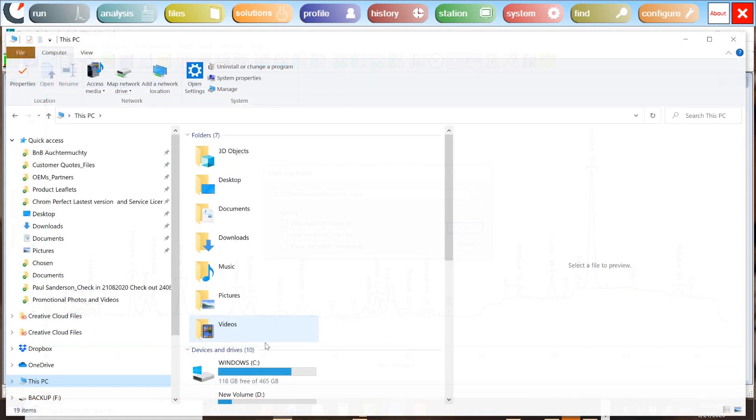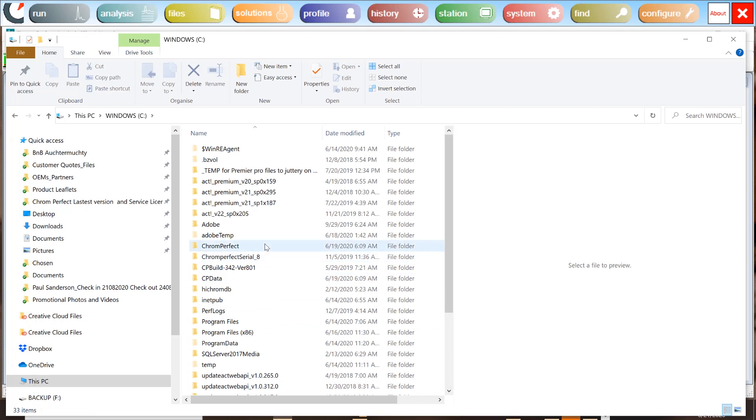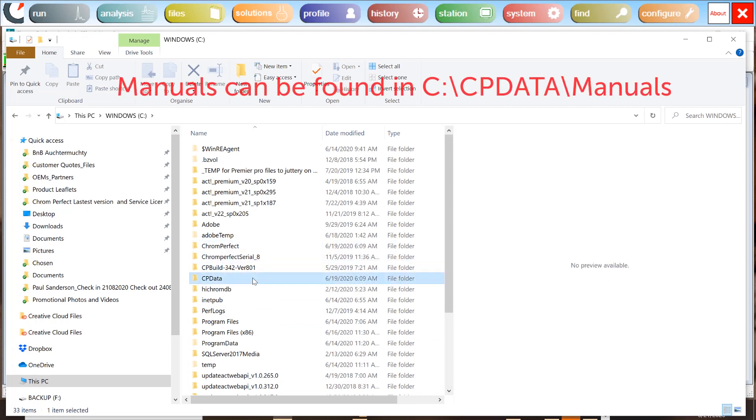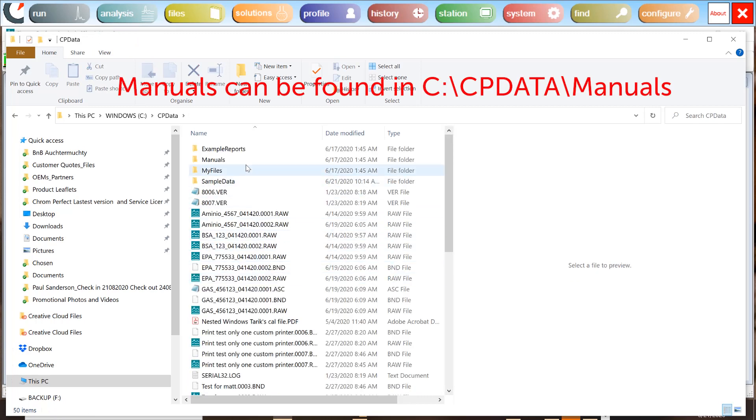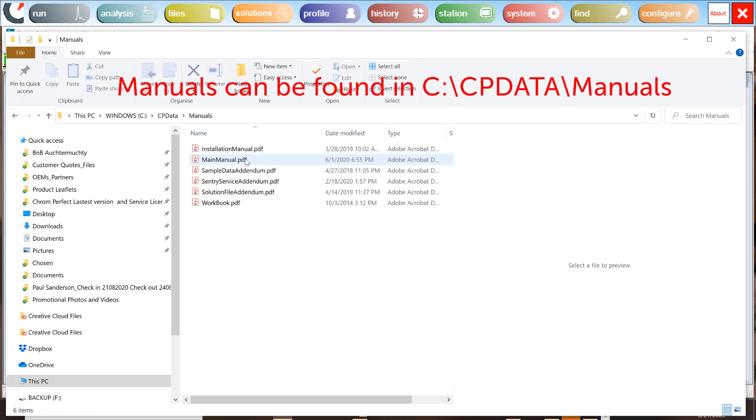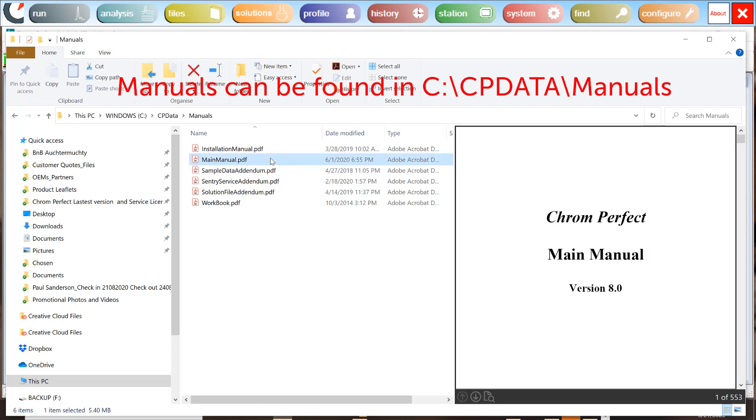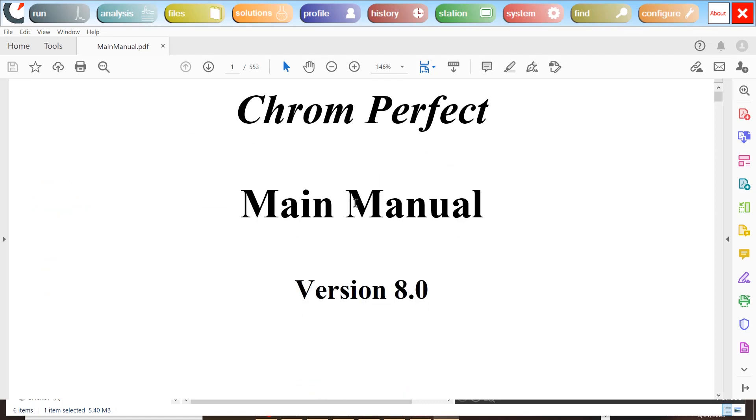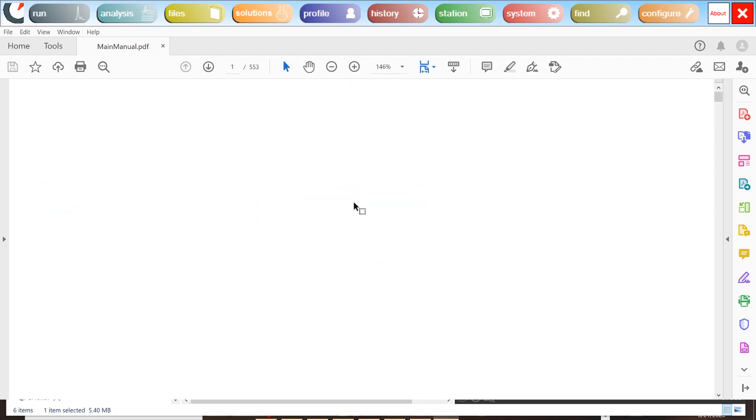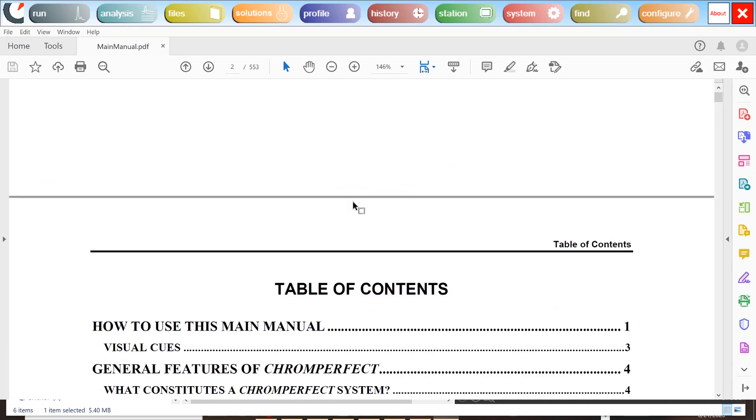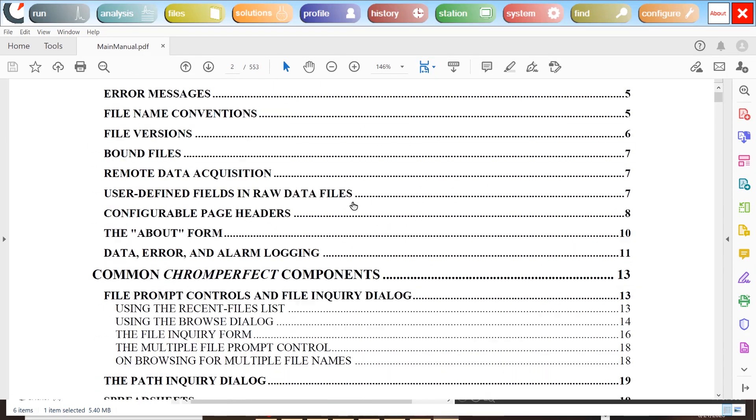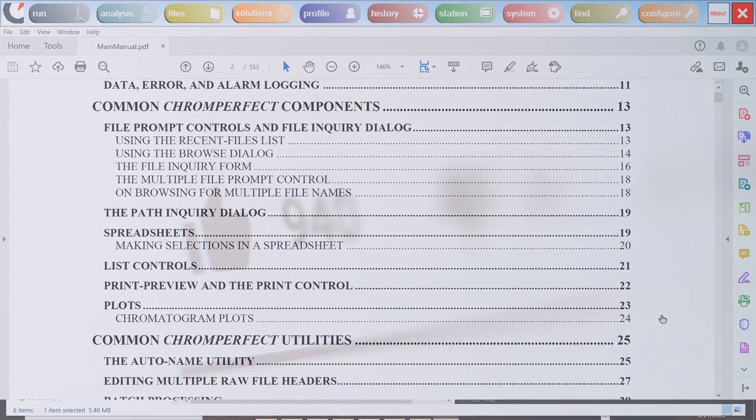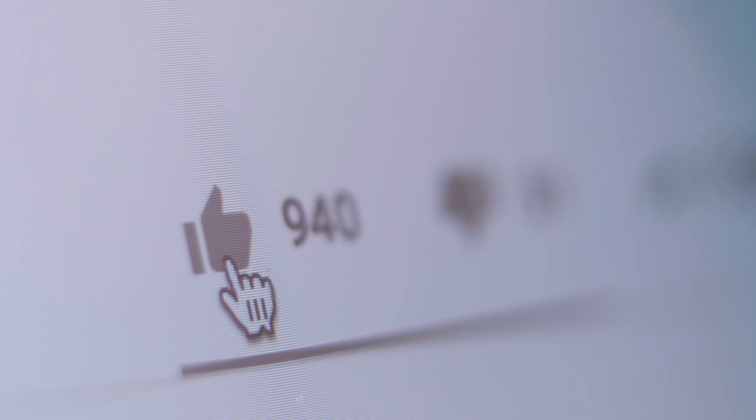More information about integration is included in the ChromePerfect manual in the chapter titled Analysis. You can find your ChromePerfect manual in the manuals directory within the cpdata folder.